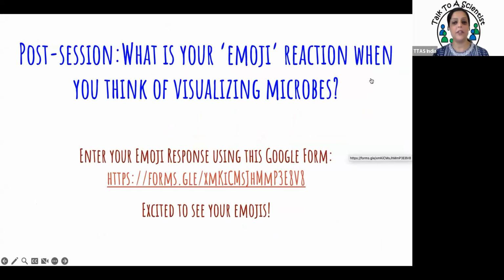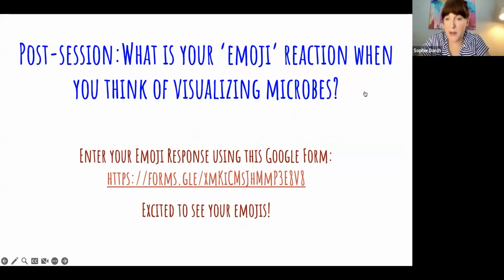Absolutely. Yes. So Bhargavi just wants to know once again, why are some bacteria red and some green in that video? So the red ones were not talking. Yeah. So in that example, the red ones were not talking. What we need to do to actually look at them on that type of microscope is they all have to be labeled with at least one color so we can actually see where they are.